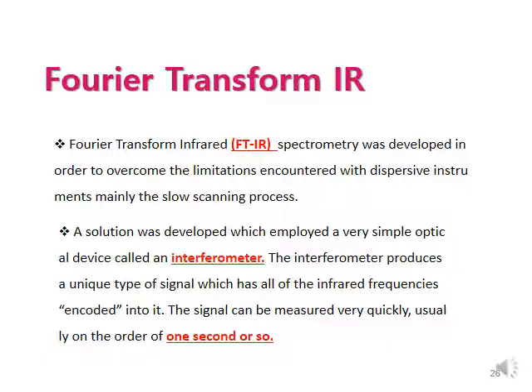How can this happen? It is because there is an optical device called an interferometer, which encodes the infrared frequency so that the signal can be measured quickly.